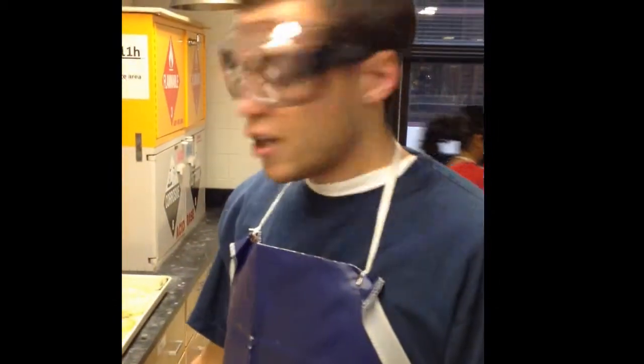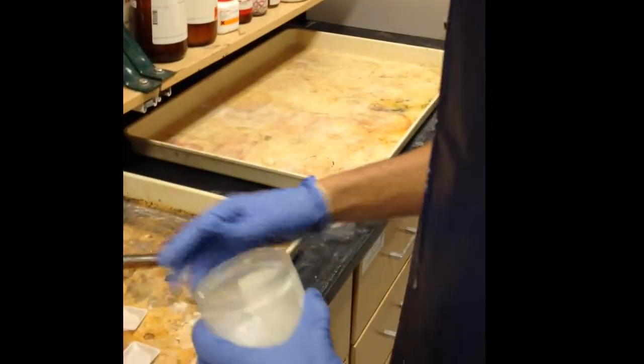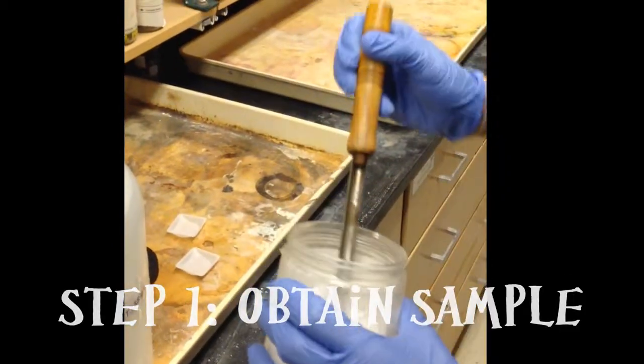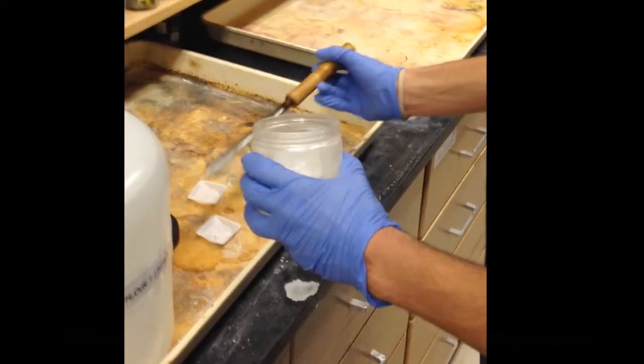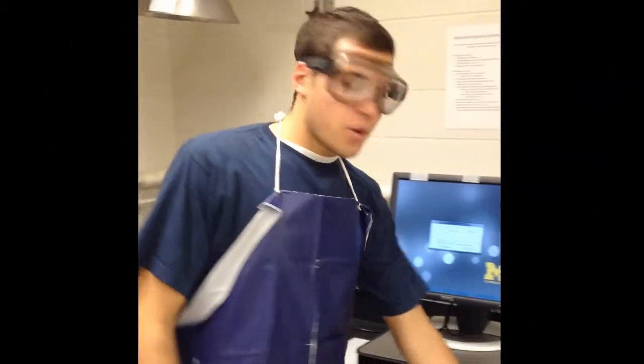Spectroscopy today. Usually when we do infrared spectroscopy, we're attempting to determine an unknown compound based on bond stretches, but for the sake of explanation today, we're just going to use a known compound, benzoic acid. So the first thing we're going to do is just get some material using a spatula. Okay, so we grabbed our benzoic acid.